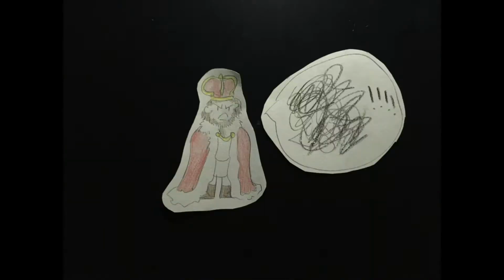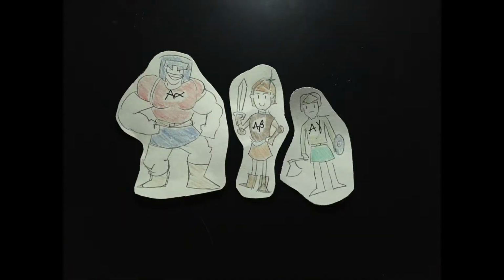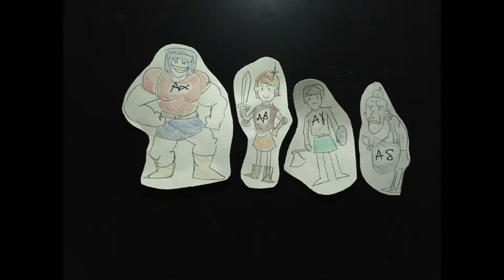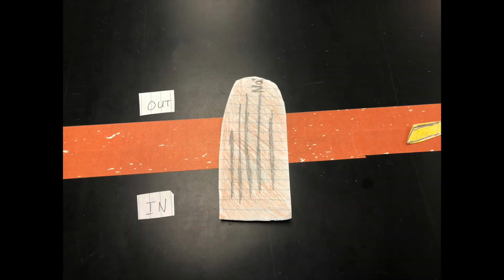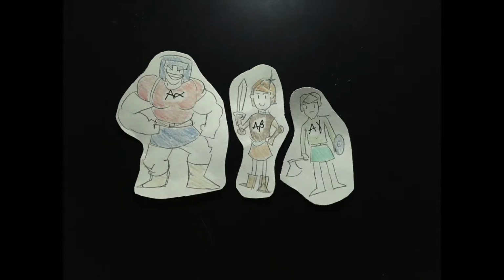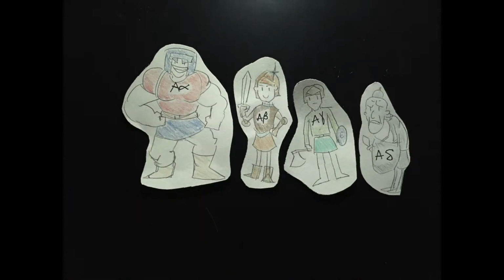A-beta and A-gamma neurons are recruited next, requiring higher stimulus potentials than the A-alpha motor neurons. The last of the neuron fibers to be recruited are of the A-delta variety, which are the smallest and the least myelinated of the 4 types. As such, they require the highest stimulus potential to fire, and they set the maximum CAP amplitude. Total CAP amplitude increases until all available neurons are recruited, which is signified by achieving max CAP.